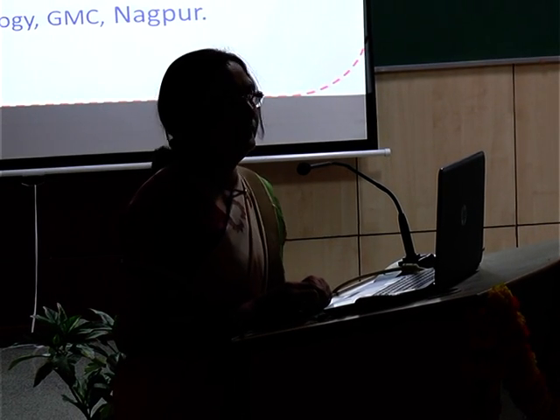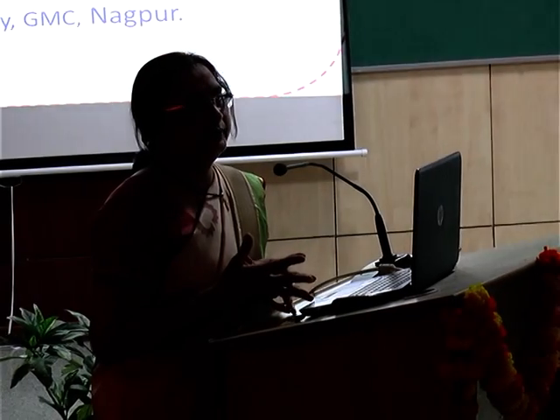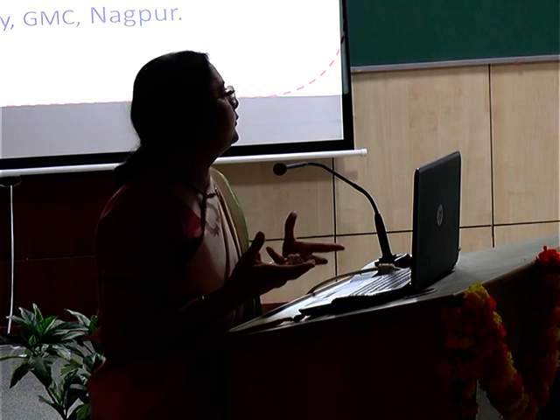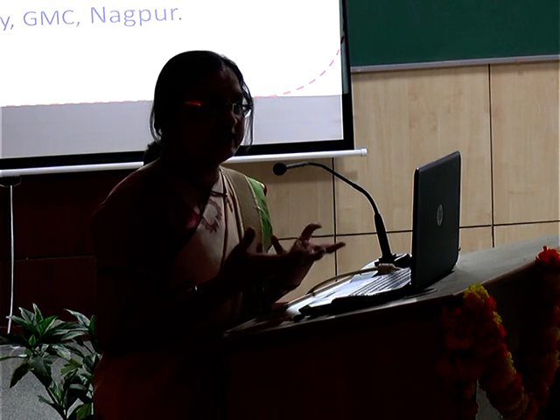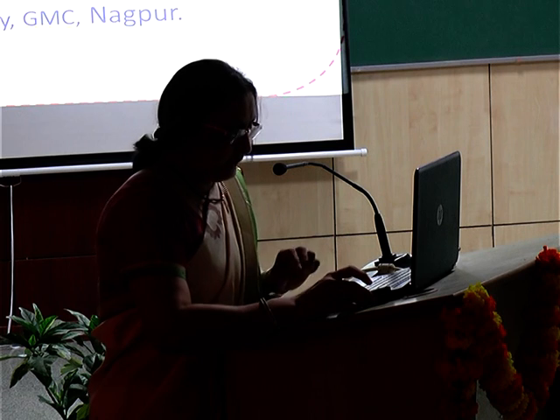My talk is basically a crux of all that has been told to you in the last few lectures, and it will be mostly case-based: how you approach a case of malignant effusion and how you diagnose the case using basic stains as well as advanced studies.